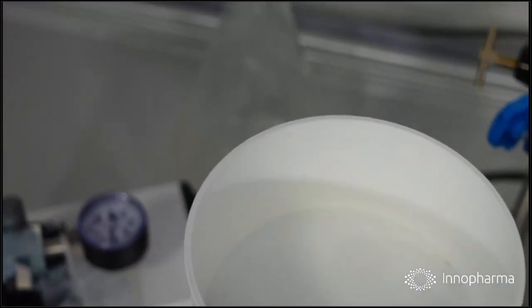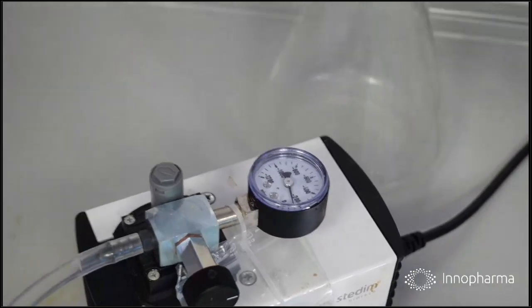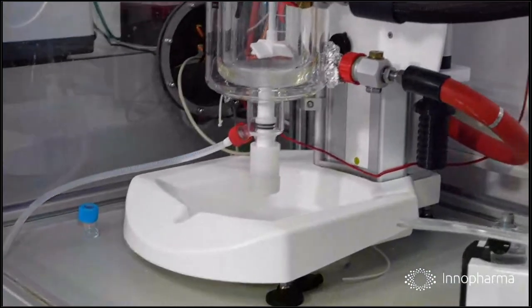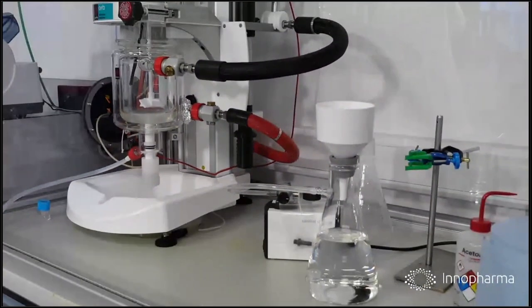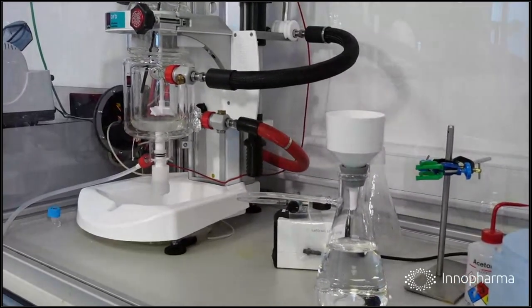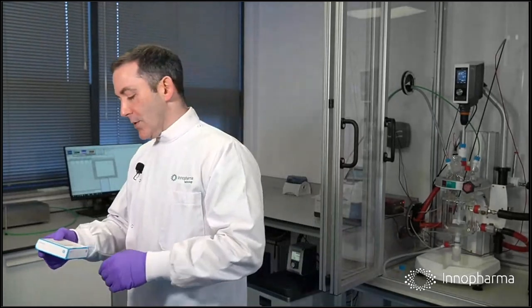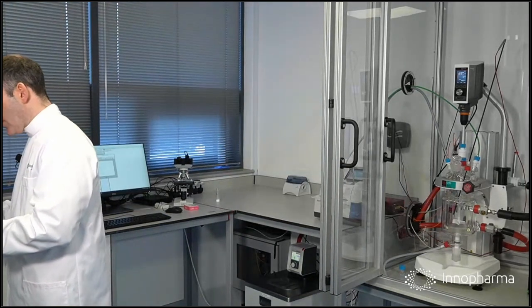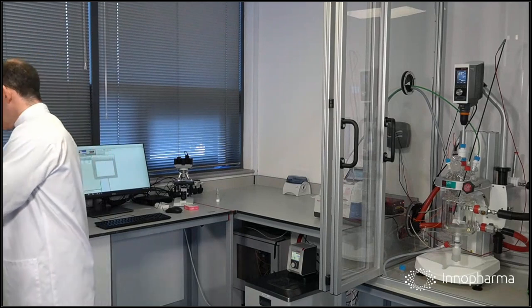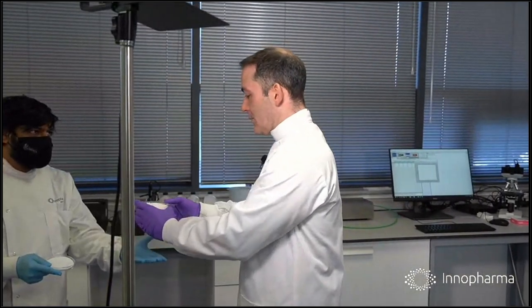So you were asking about the grade of the filter paper. It does have a certain grade. It has a specific mesh or filter size. Yes. Off the top of my head, I'm not sure what it is. Oh, good. So the filter papers are identified, in fact, different filter papers are identified by the effective pore size, yes. So in this case, the Whatman filters are just identified by the number rather than the pore size. But, oh, excellent. Thank you. All right.